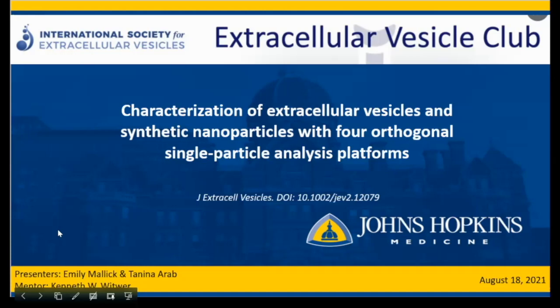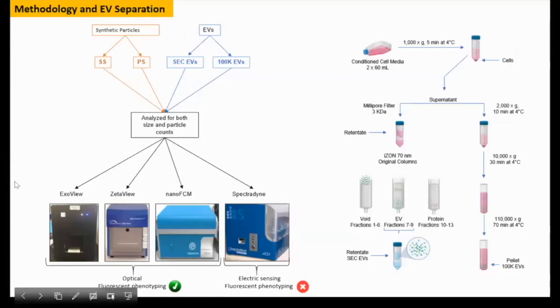So I'm going to go through, and Tanina's going to take us through the second half of our paper titled Characterization of Extracellular Vesicles and Synthetic Nanoparticles with 4 Orthogonal Single Particle Analysis Platforms. Now, as most of you are aware of the different EV isolation and characterization methods, I'm just going to briefly touch upon our experimental design and the 4 technologies that we have investigated.